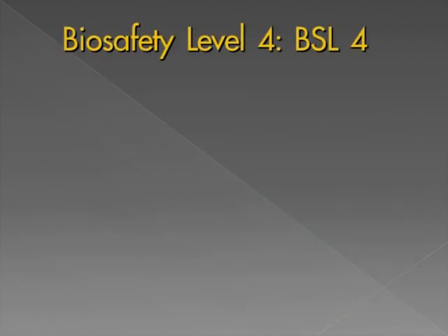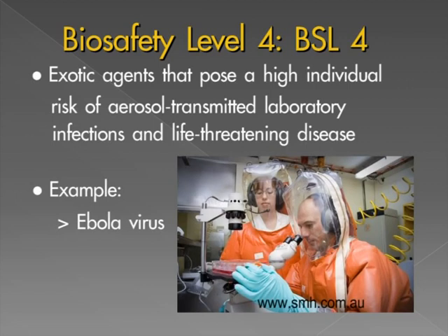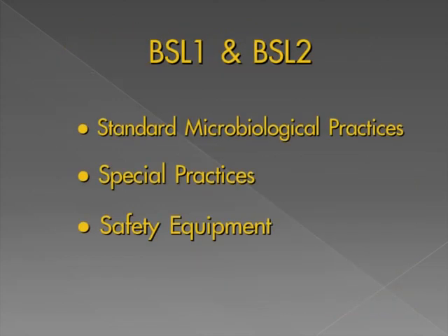Biosafety Level 4 practices, safety equipment, and facility design and construction are applicable to facilities that work with dangerous and exotic agents that pose a high individual risk of aerosol-transmitted laboratory infections and life-threatening disease for which there is no applicable vaccine or therapy. Currently, only BSL-1 and BSL-2 work is being done at CRI.